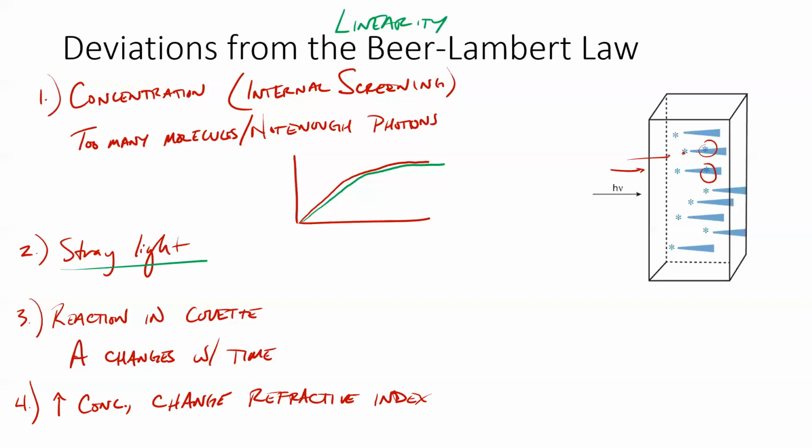And so, if we have something that really is going to change the refractive index of water by a whole lot, this is usually not necessarily ionic compounds, but if we think about dissolving organics in there, or something that is not very colored, so you can dissolve a whole lot of it in there. Hopefully all of you at this point have at least poured concentrated sulfuric acid.